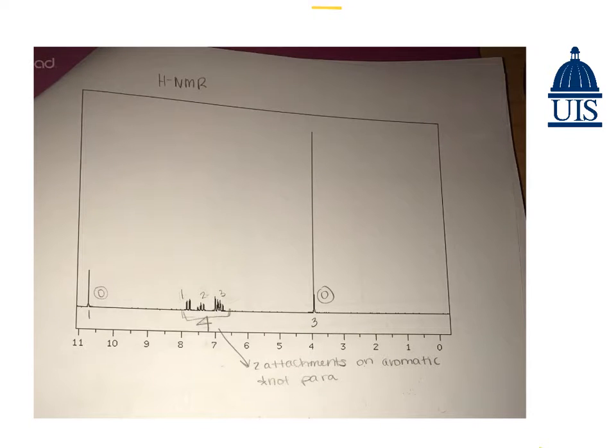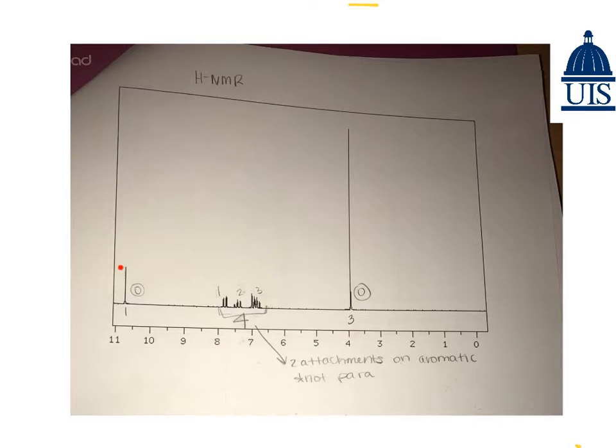So now we're going to be looking at this formula with proton NMR. And the first thing we notice would be how many peaks we have shown on the spectra. So here we notice we have 1, and because it is a single peak with no splitting, we know according to the N+1 rule that it has 0 hydrogen neighbors.